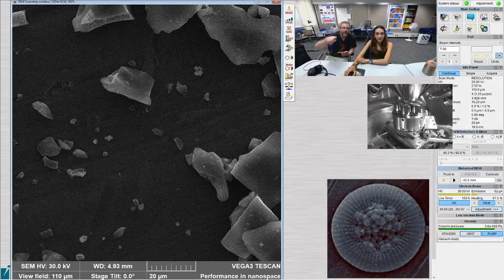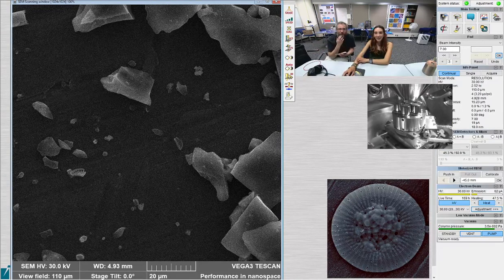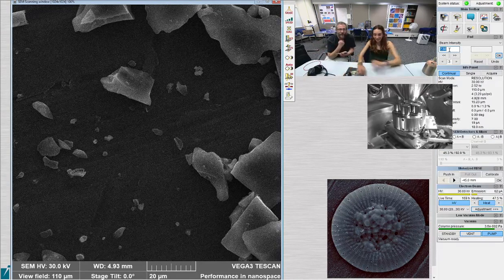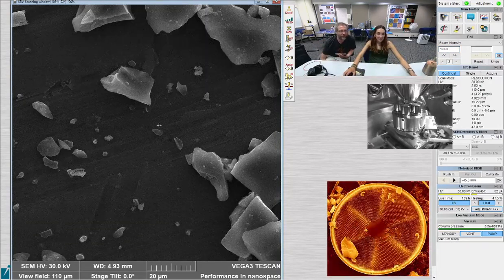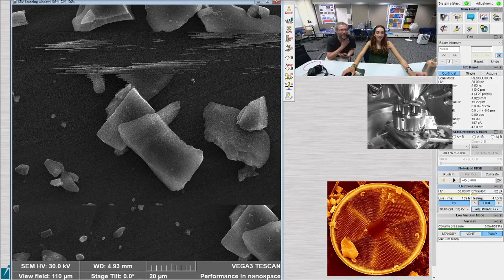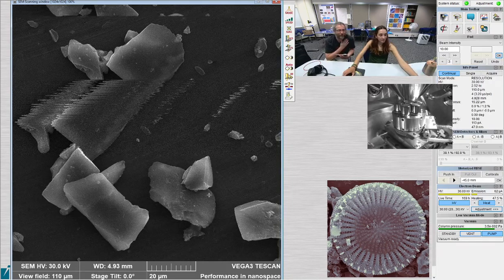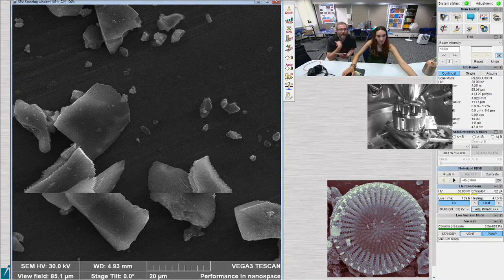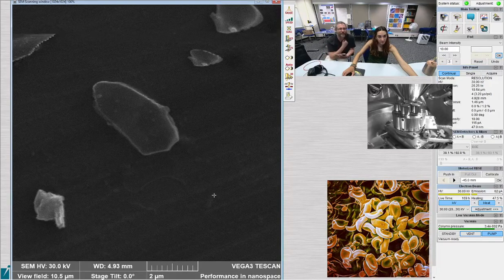You might want to switch back to 10 just so that you get used to changing the beam intensity. Because when you're cruising around, it's actually a little bit easier to see when the beam intensity is high because you're zoomed out a little bit, and it's easier to spot stuff. And then you just have to remember to change it back to 7 when you go to take your picture. But I will sometimes just be lazy and scroll around at 7 because I can see well enough. But I feel like when you're looking for something really little, it's useful to have the beam intensity set to 10, and then you can easily zoom in and out on it.